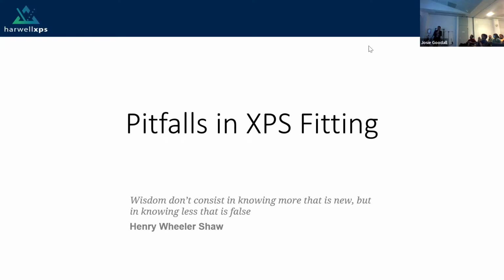Let's just see if the monitor is working. Oh. So, the pitfalls. The pitfalls in XPS.